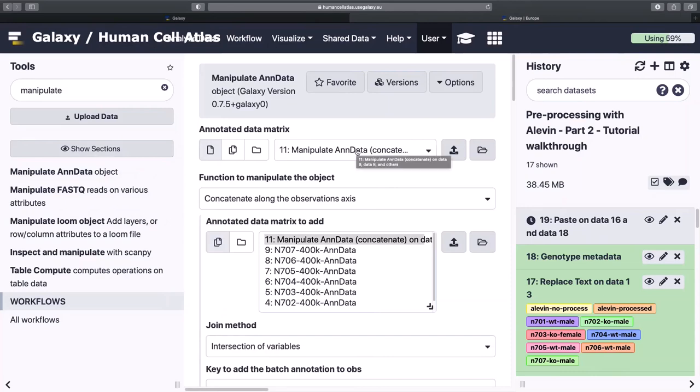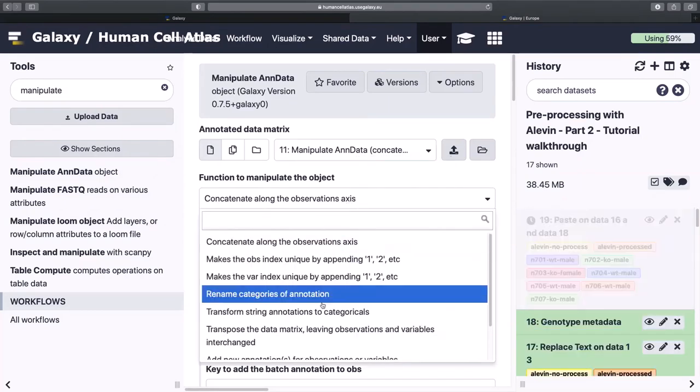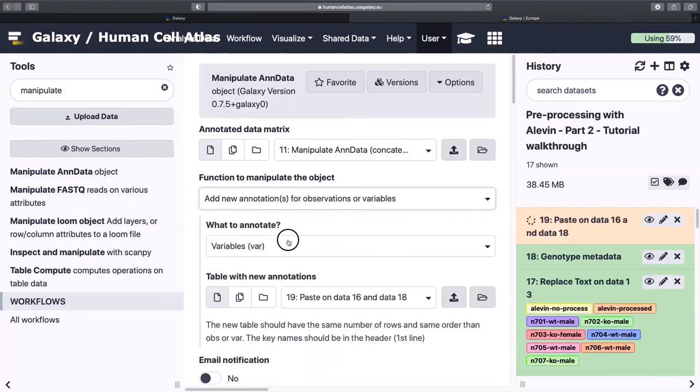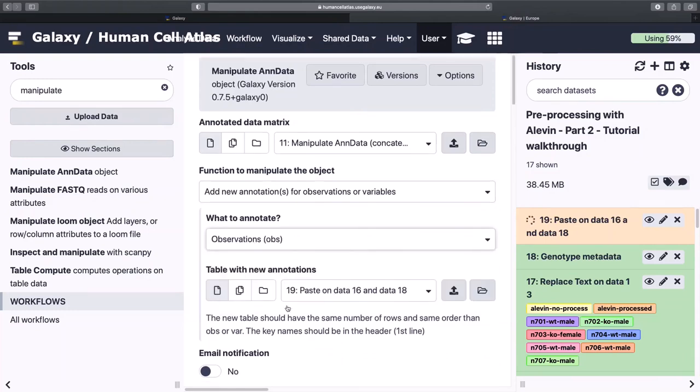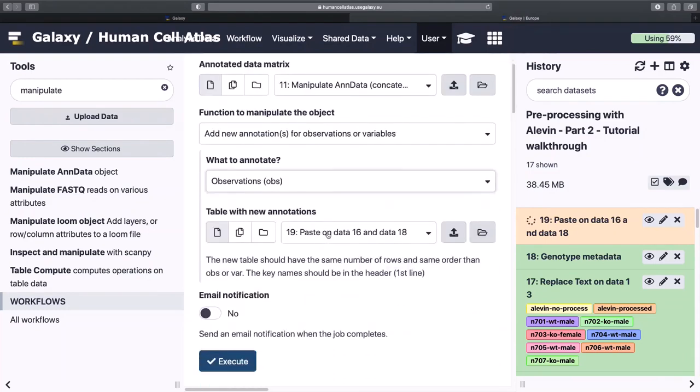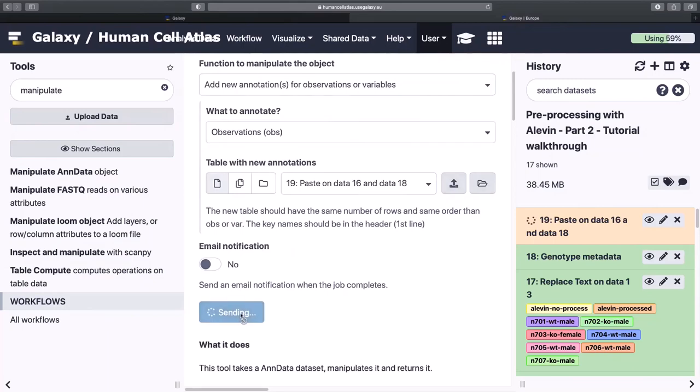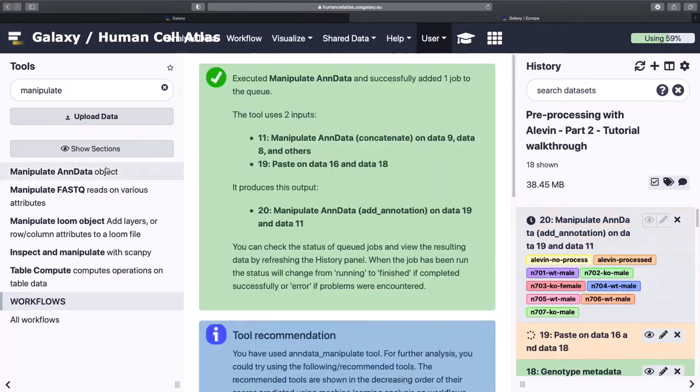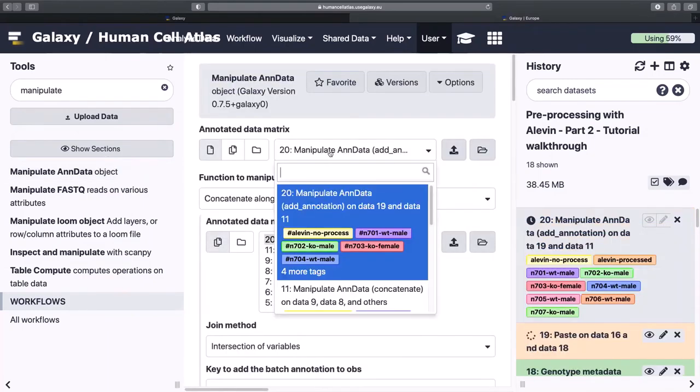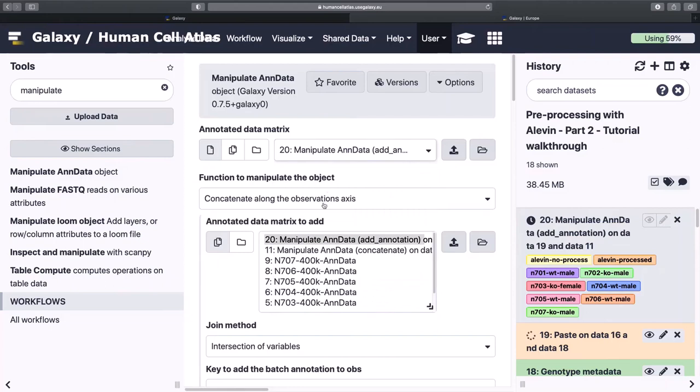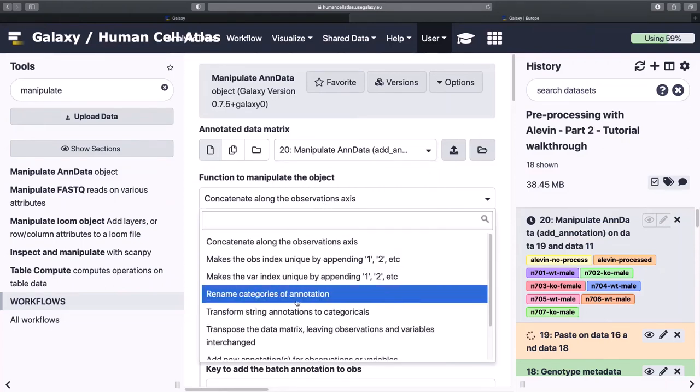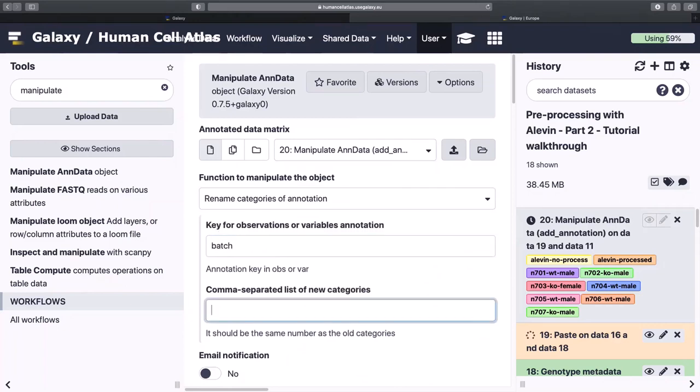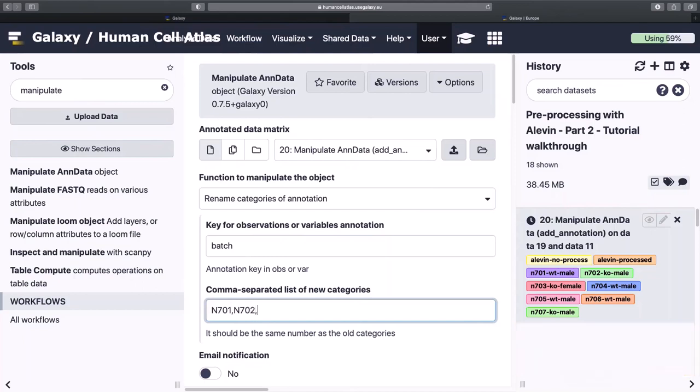And then next step, we're going to be manipulating end data by adding that information in. So add new observations, and it's going to be that. And while that's working, we also know that there's some labeling that's poor. So we're going to try and rename these categories of annotation. So rather than where we have it being batch 0, 1, 2, 3, 4, 5, 6, we're going to rename them their actual indices from the experiment.